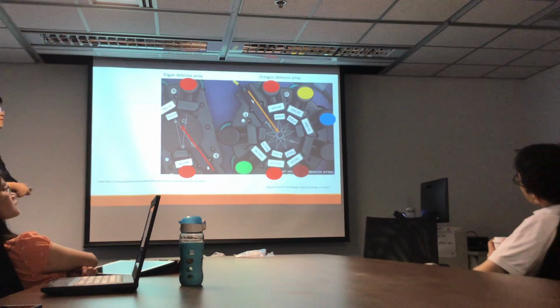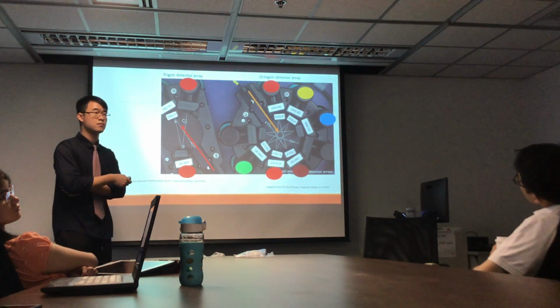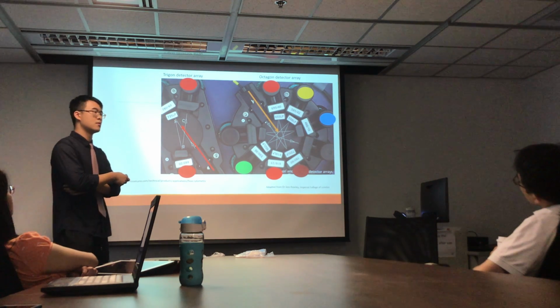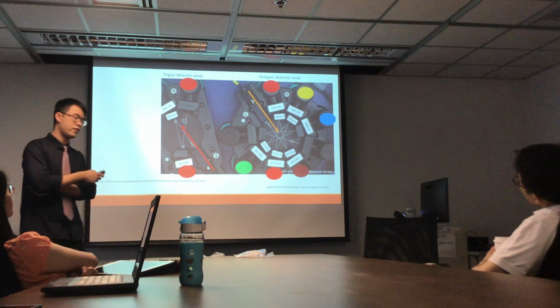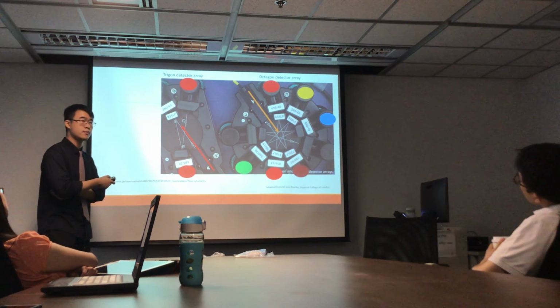In practice, do you use one certain type of antibody if you expect one certain type of cell, or do you use a mixture of antibodies, and depending on the wavelength you get back, you know which type of cell it is? We do have a live example later on, but usually we use more than one antibody to confirm.